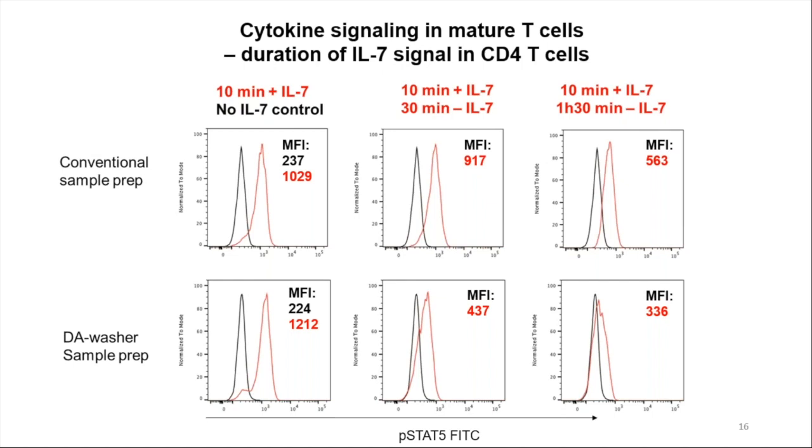I think having better washes probably helps, and not centrifuging the cells probably helps. I think the cells retain better membrane integrity. The curious people may be able to give you a more technical answer. All I can say is it's working.